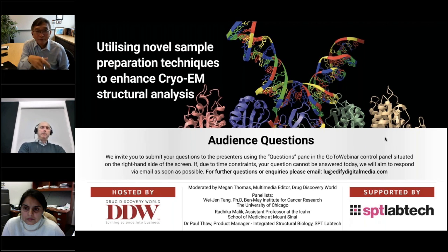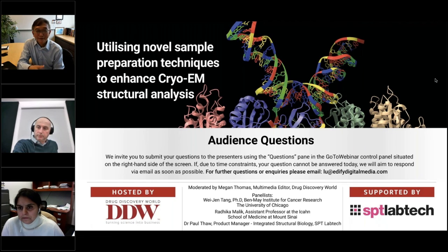And in terms of optimizing with the number of instruments, I highly encourage any institute that can afford it to have a Spotiton or a Chameleon, as well as the Vitrobot. You can use the conventional method and also try the Chameleon method. You have to optimize the sample, and it's low throughput, but that's where you can get the structure.